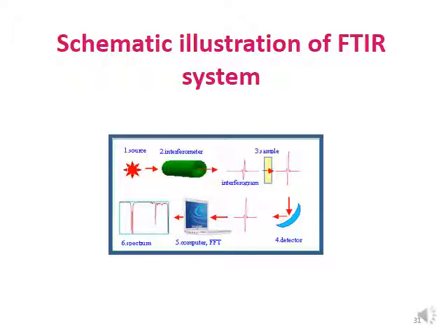Before it passes through the sample, we can investigate the interferogram to see whether the instrument is good or not. After that, it gives you the interferogram signal. This is very unique, showing that different samples have different interferograms. After that, it passes through the detector and comes out as output in the computer. Lastly, you get your output as a spectrum.